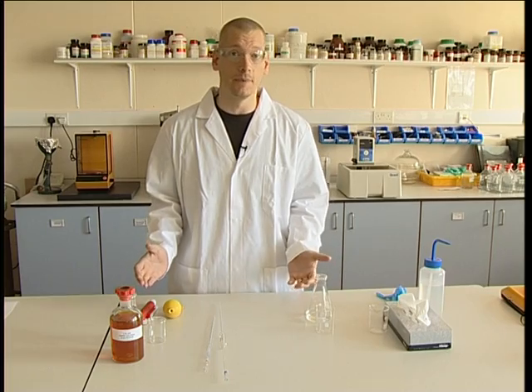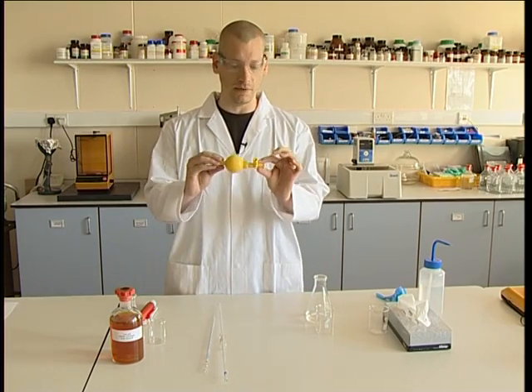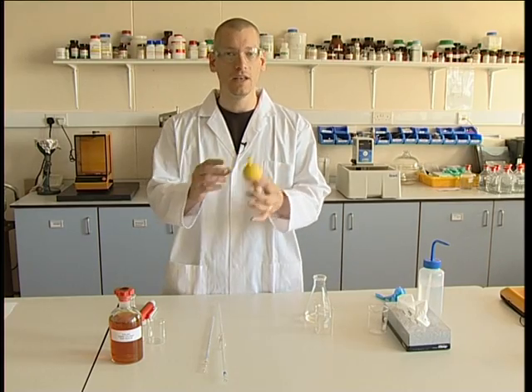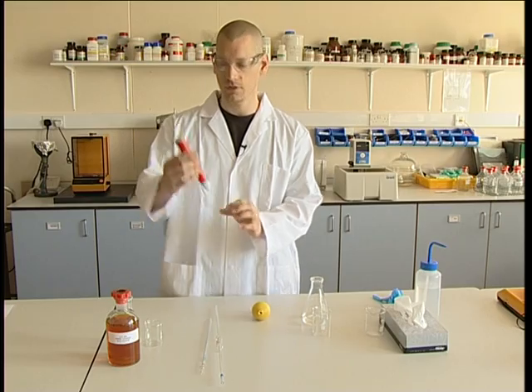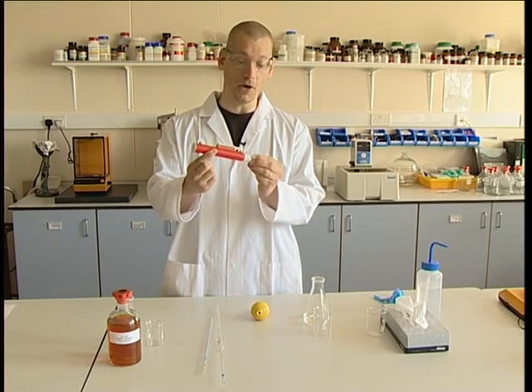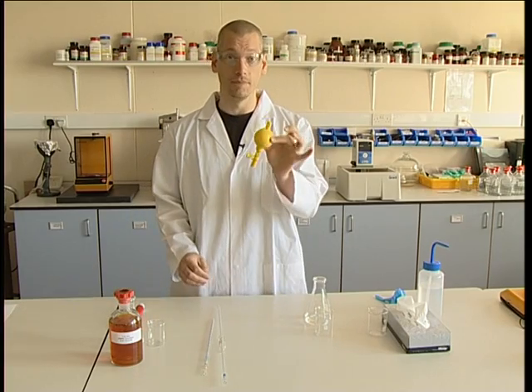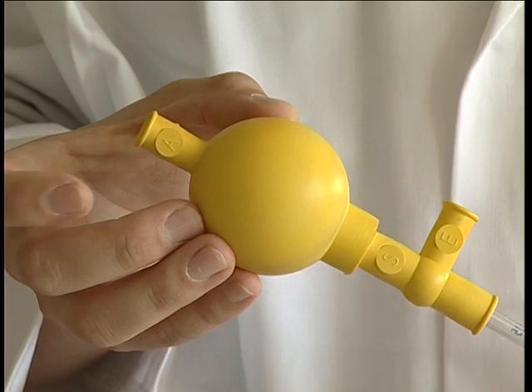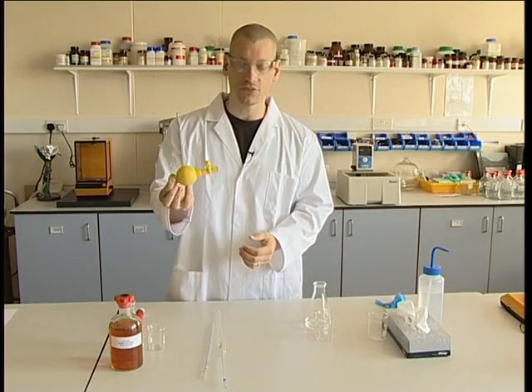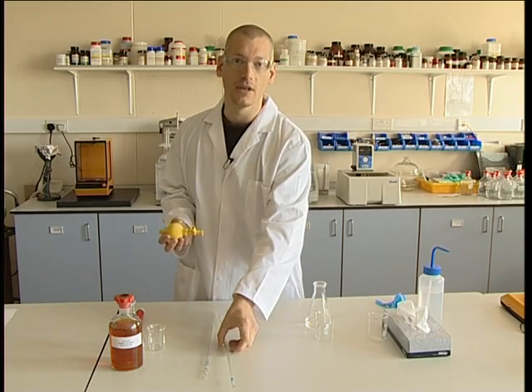Once we've selected the type of pipette, we need to select the pipette filler. There are two main types: one that goes back maybe many decades — it's the traditional rubber pipette. The other is a slightly more modern pipe pump. If we just look at the rubber filler to start with, we have various different aspects of it.